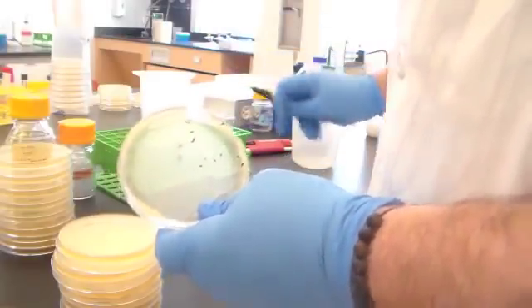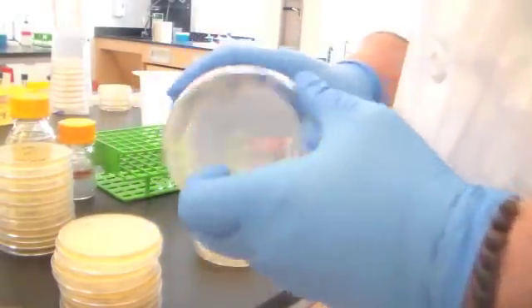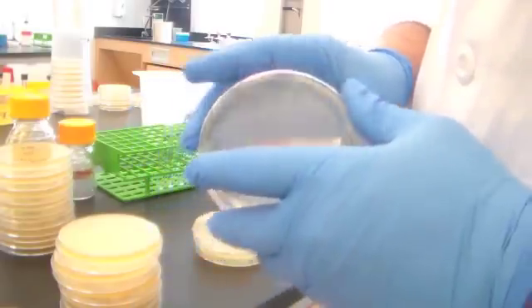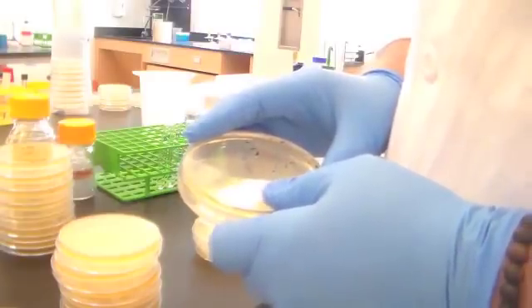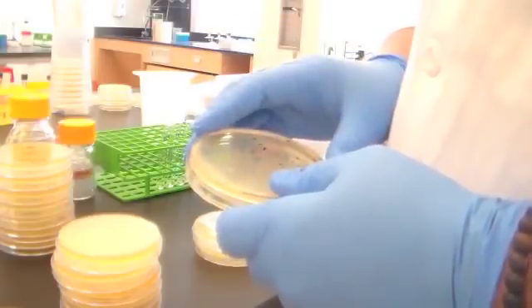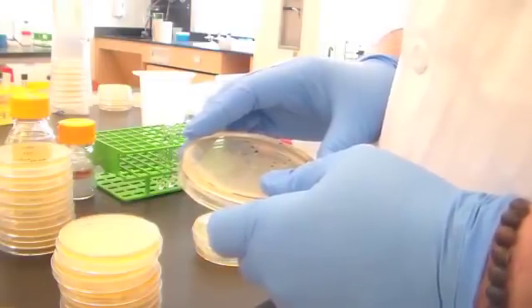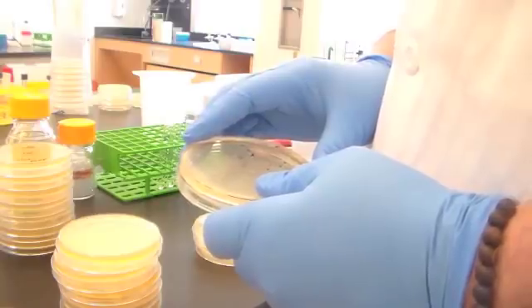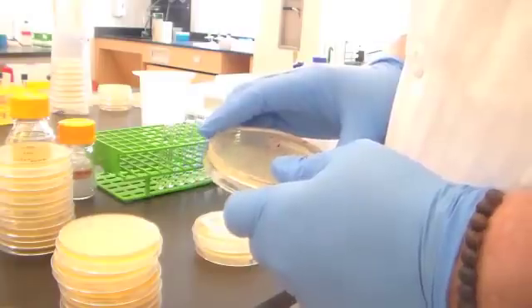I've already bored you enough. I'm not going to make you count with me or watch me count this, but this would be a nice countable plate. This is hopefully what you're going to find somewhere in your dilution series. And in the handout, we'll talk about how you'll do the calculation. So you can calculate the titer of your culture at that particular time point, either by using a formula or simply by logically reasoning it out. That's better described on your handout, and we'll also be talking about that in lab one-on-one.